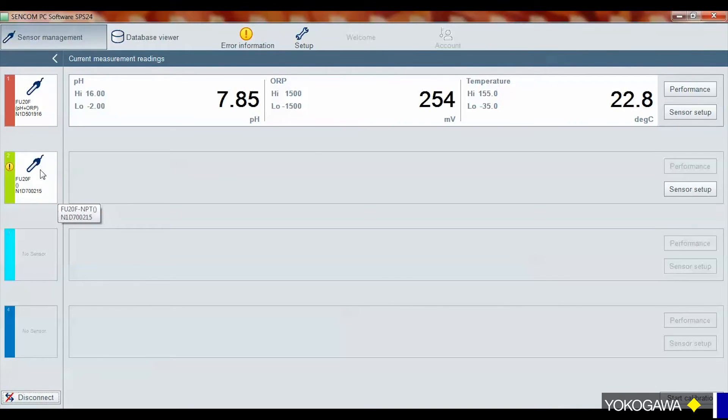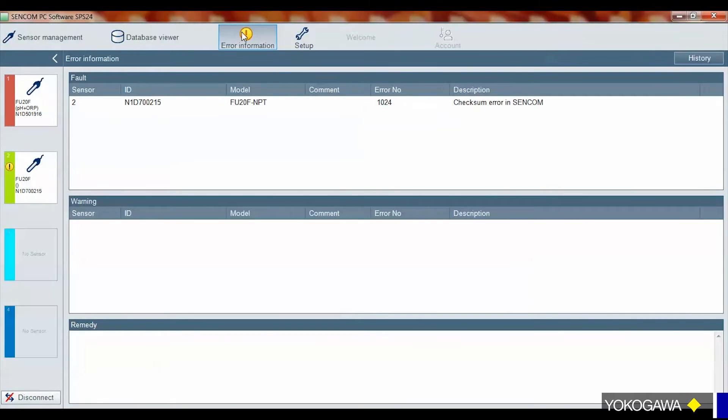One of the benefits of the software is any alarms — you can see it shows that I've got two sensors connected, and we have them connected via an interface box and sensor and cable. But only one is actually active because I keep getting this error message. It tracks any serial number and any errors that it may have, any failures that the sensor may have — it'll let you know right away. You'll also, if you have it connected to an analyzer or a recorder, get that as well. This log keeps track of all of that by unique serial ID, and it tells you the error code, showing you the date and time stamp that that occurred.